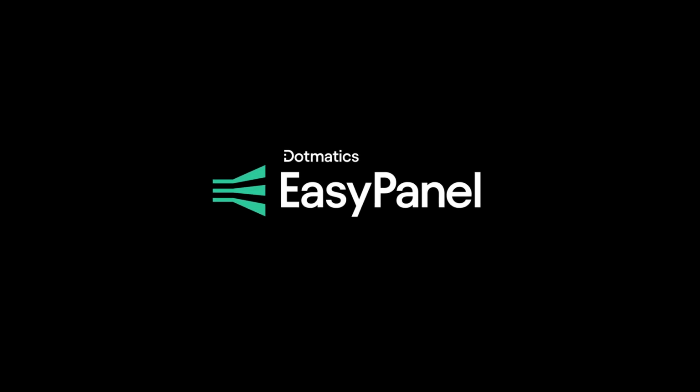As we continually strive to develop even smarter versions of EasyPanel, we really look forward to receiving your feedback and suggestions.